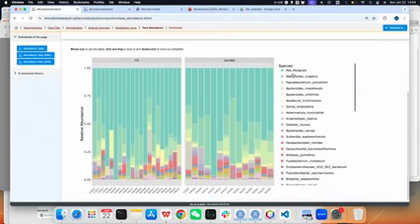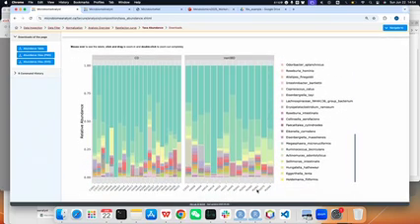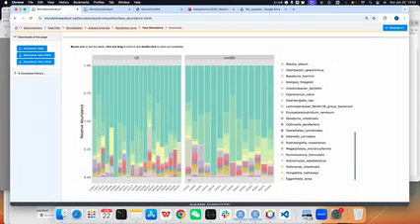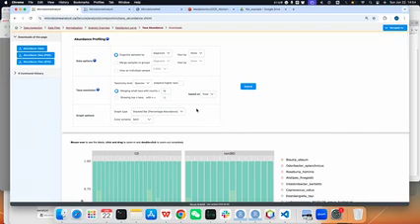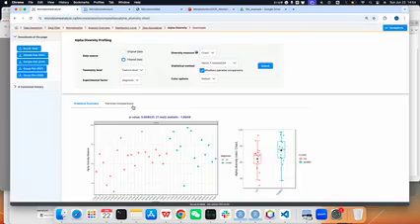So you can see a lot are not assigned. It's common because it's 16S data. You can see each sample's structure, and whether the overall pattern is different. We can see that most species appear in all the groups, but maybe they have different percentages. This is a visual exploration, so we don't have a statistical control. Then we can use the diversity analysis to see the statistical result.